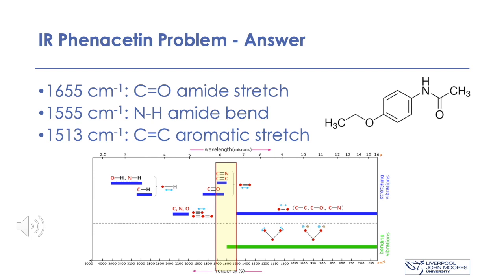So it fits with the structure of phenacetin and is probably an identification good enough. It suggests to continue working on the identification of the drug with more costly methods.